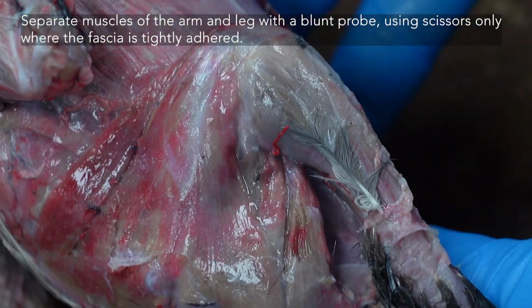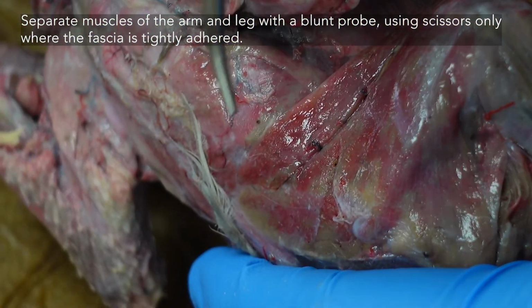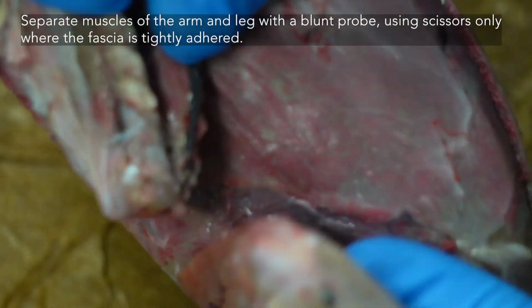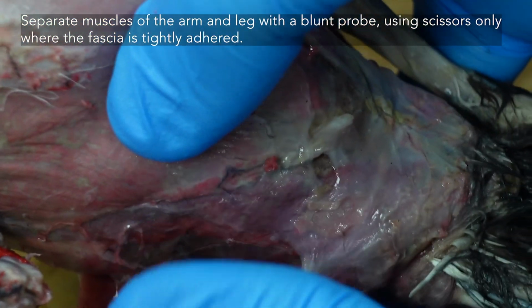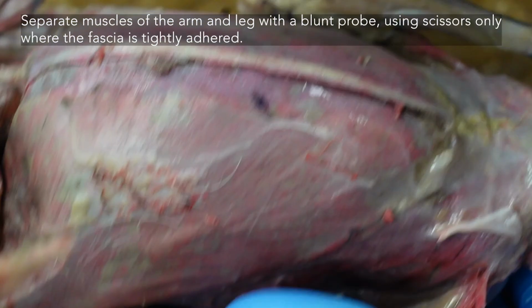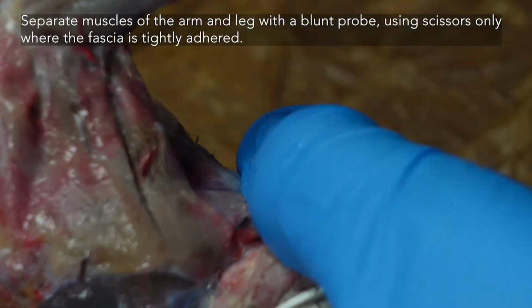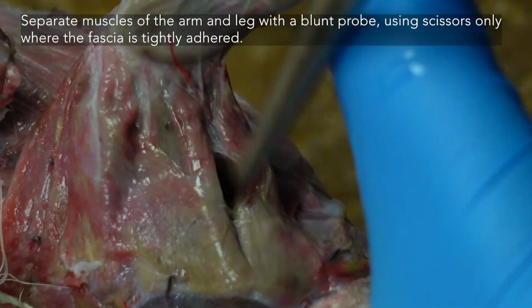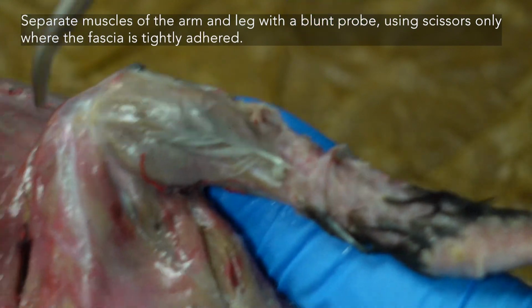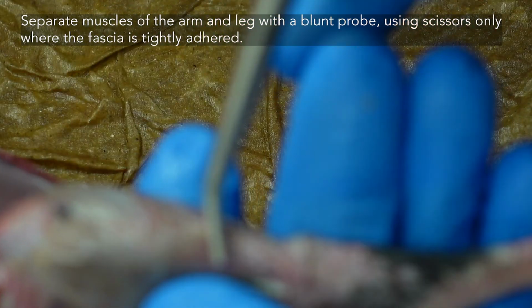As you are separating the muscles of the leg, be careful not to splay it too far to the side, just to preserve this muscle here, your iliotibialis cranialis. So you do want to separate it, but again, too much pushing and pulling, you might break it. But again, this is for investigation, so if you break it, it's fine. If it's broken and you can tell me what's broken, if you can name it, that's good. So again, move the leg around, look for those separations in muscle tissue so that you can get your blunt probe in there and separate fully from the top to the bottom, or at least close to the top and bottom, on both the femur and on the tibiotarsus area.